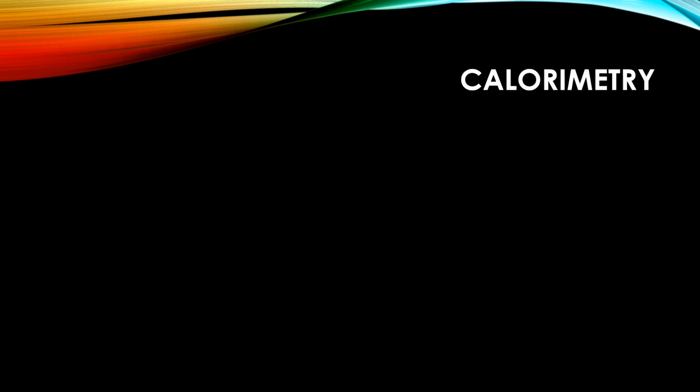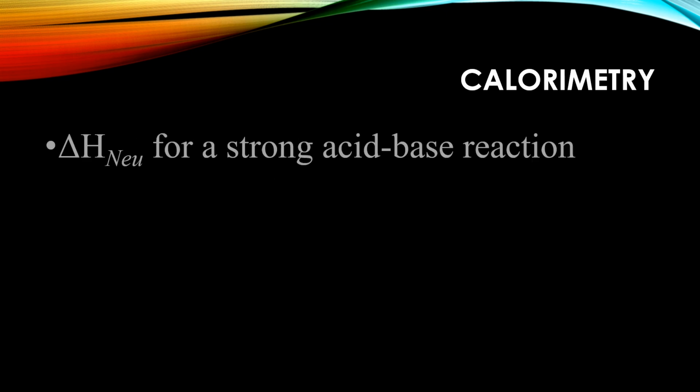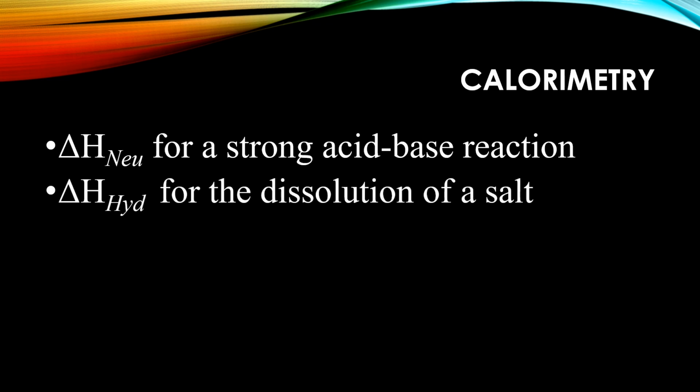We'll study two processes. We'll find the delta H of neutralization for a strong acid-base reaction, and find the delta H of hydration for the dissolution of a salt. Let's start with the acid-base neutralization.